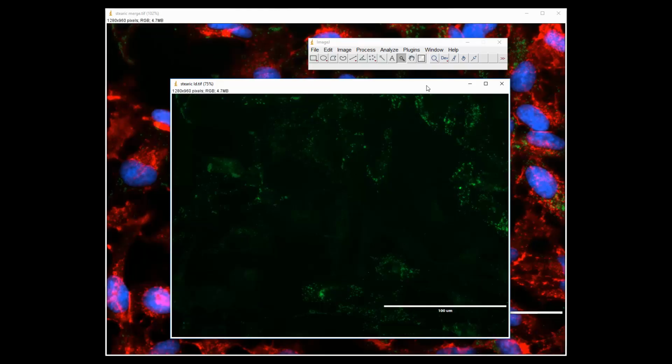And like I said, how many cells you choose is kind of up to your group. There's no such thing as too many. It's just the amount of your time and how valuable it is to you. But I would say definitely 5 to 10 cells. Usually 10 cells is normally pretty good on this particular example.